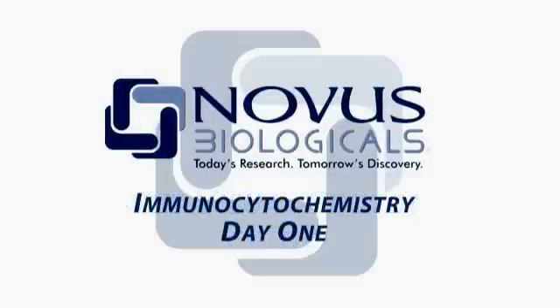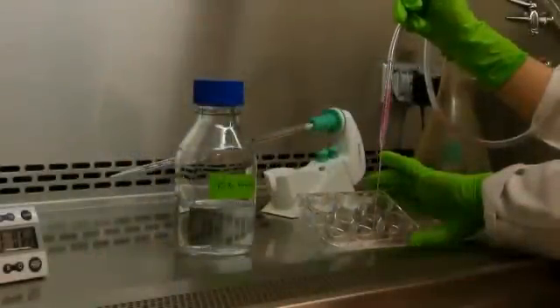With the cells plated on the previous day and cultured overnight, we are ready to start the ICC procedure.